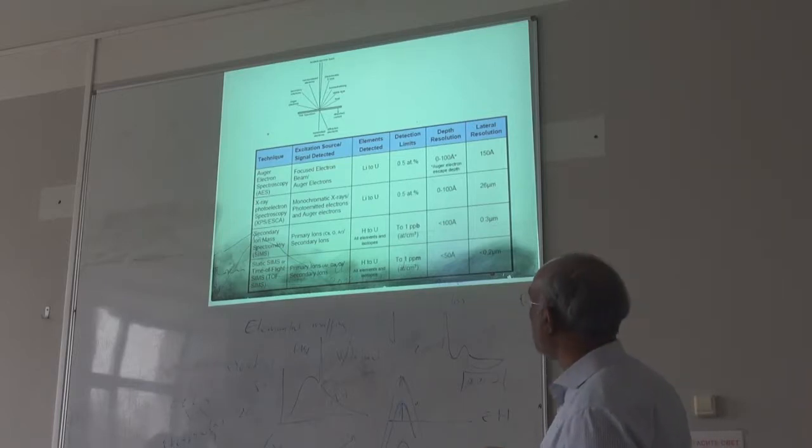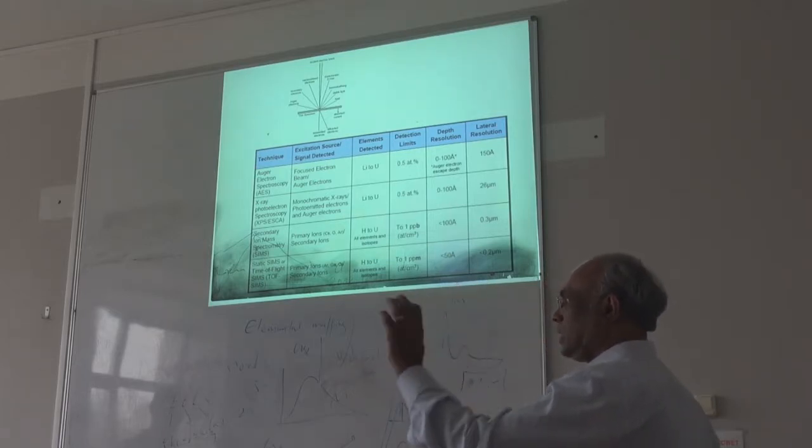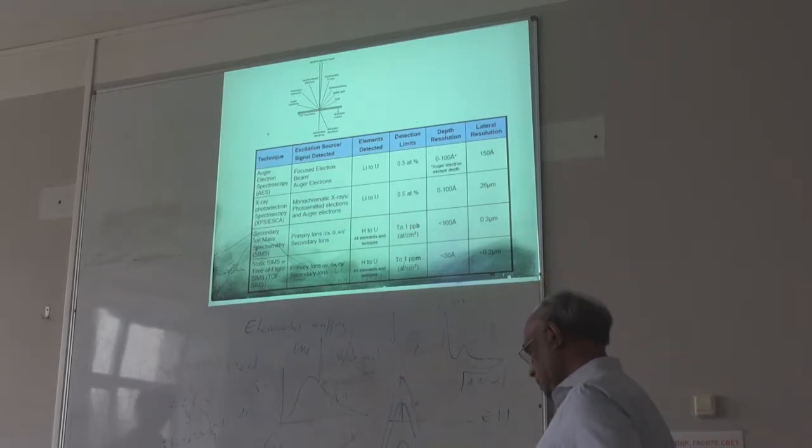And I'm going to talk about these two now, something called XPS and also UPS. I'm not going to talk about these two. This is using ions, not electrons. You have to use charged ions for SIMS. This is a very expensive instrument, SIMS and time of flight SIMS. So I'll talk about this one now, XPS.